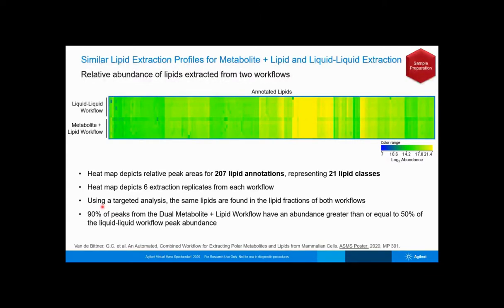Overall, this indicates that the lipids normally found with liquid-liquid extraction are still found with the dual metabolite plus lipid workflow. Additionally, the dual workflow is also easier to perform manually and much easier to automate.